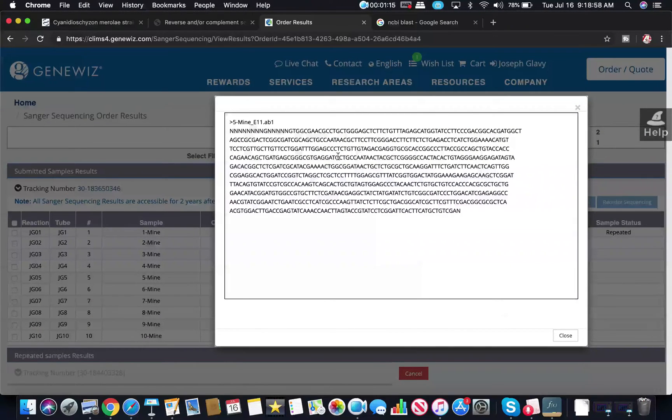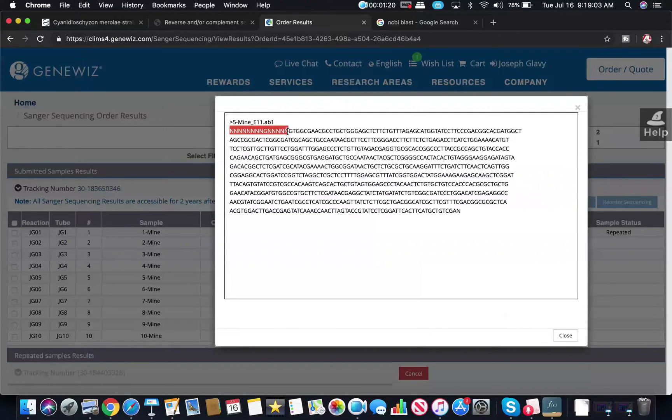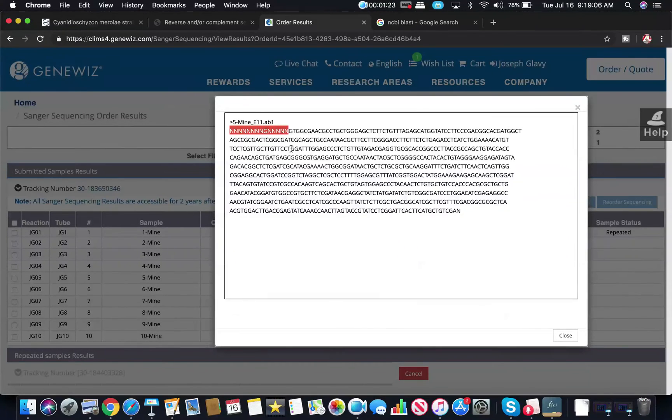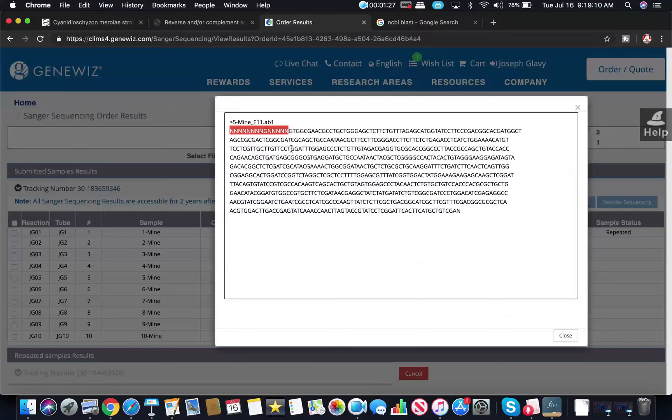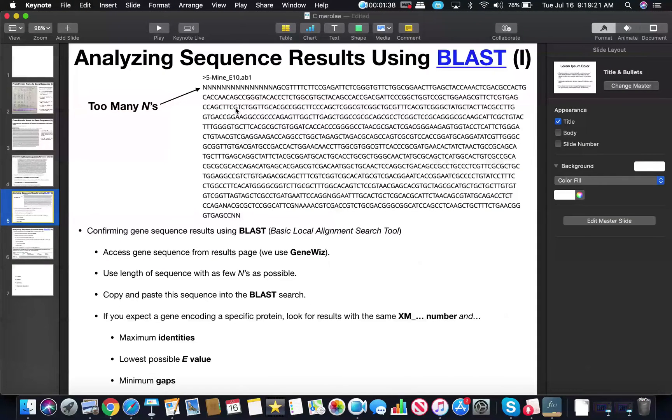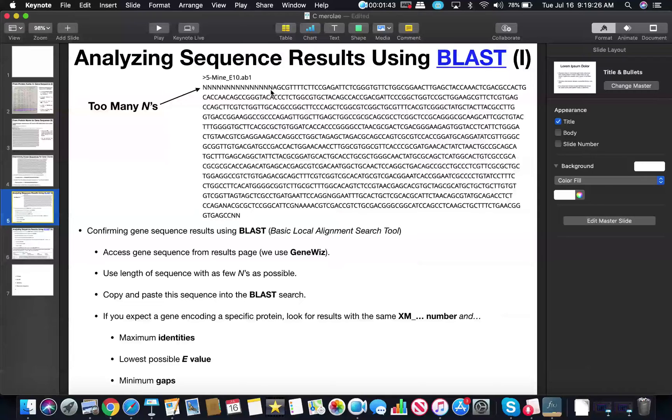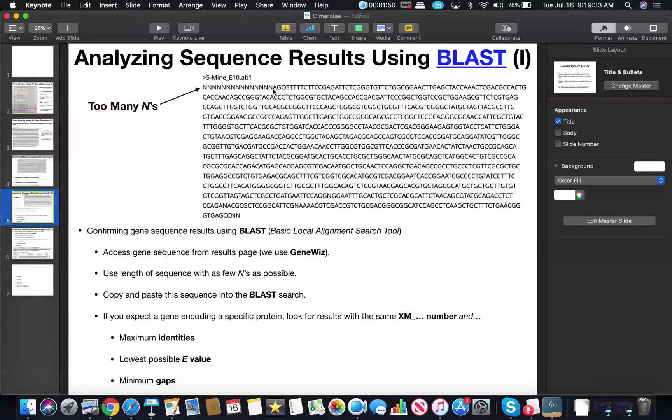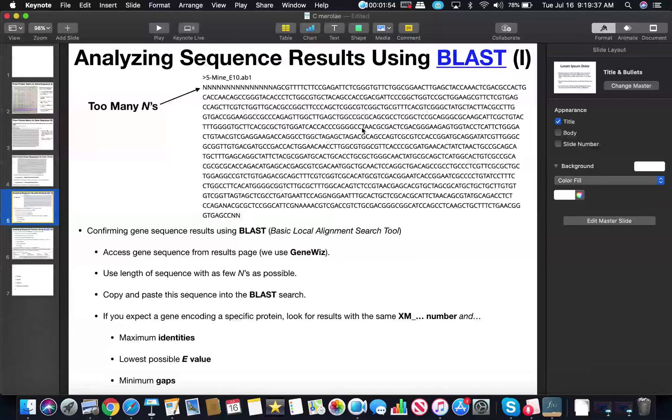Now what you'll notice is that on particularly one end we have a lot of N's here. N basically means that it couldn't tell what the nucleotide was, and for Sanger sequencing this is very common that at least one end will have a lot of N's. You're going to want to copy and paste a useful part of this because if I'm going to analyze the sequence, if this first sequence has a lot of N's, that doesn't do me any good. So I only want to use the portion of this gene that minimizes the number of N's.